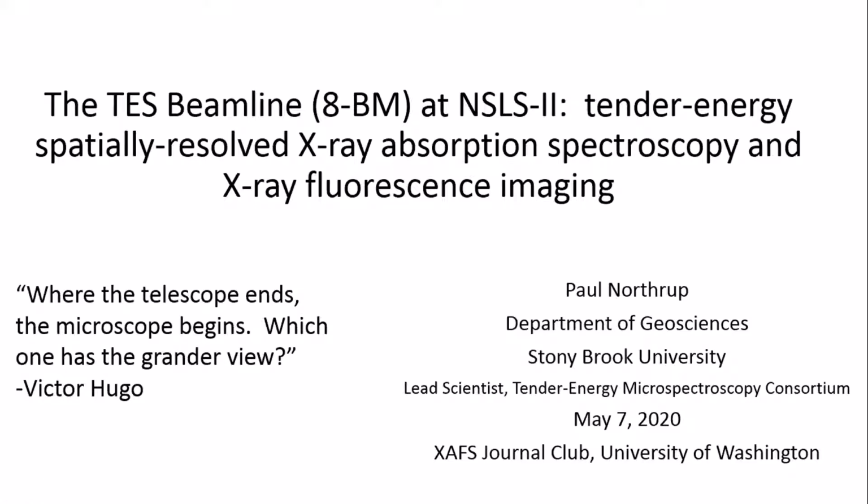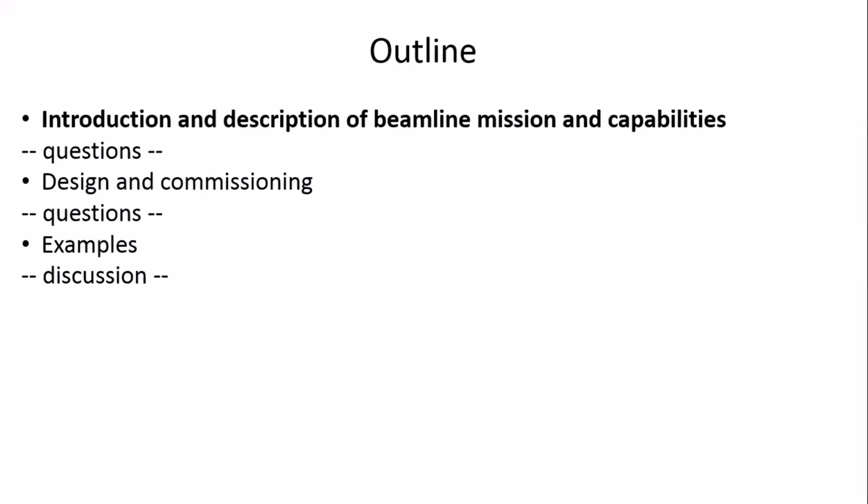Okay, so I'm going to be talking about the TES Beamline at NSLS-II. It's optimized for tender energies, spatially resolved X-ray absorption spectroscopy, and X-ray fluorescence imaging. First, I will introduce the Beamline and its capabilities, and then its design and some examples.